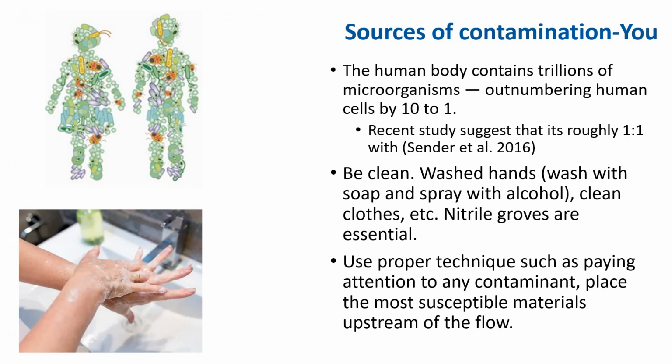So another source of contamination is you. The cultivators themselves are often a huge source of contamination. Your hands and clothes contain untold numbers of various contaminants, so consider washing your hands right before doing any lab work. It's also important to use proper sterile techniques, such as paying attention to any contaminant.